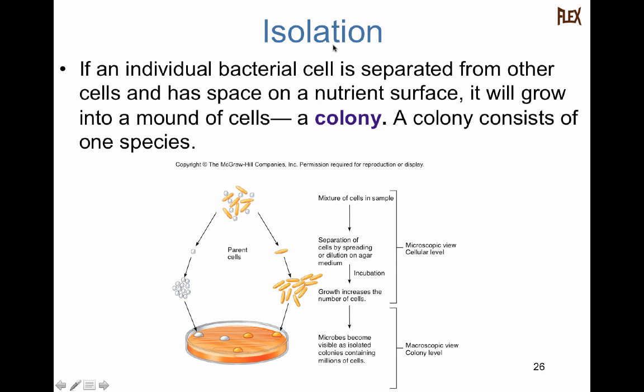So isolation. This is a very important concept for you all to remember: when working with bacteria, and please remember, this is specific to bacteria, when I say a colony, a colony is on an agar plate, which whether you're the on-site or online group, you will be working with. You will be looking at microbes growing on the surface of this agar.